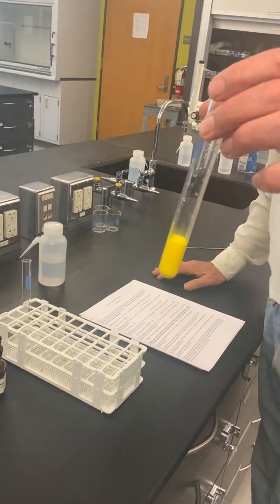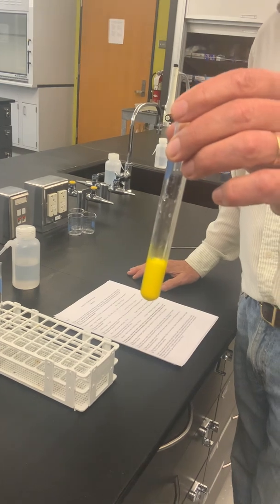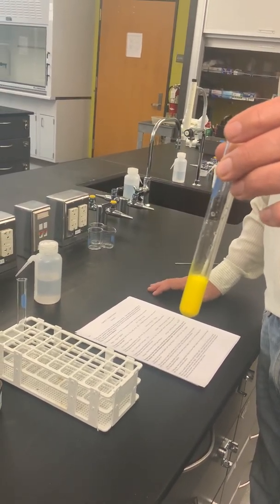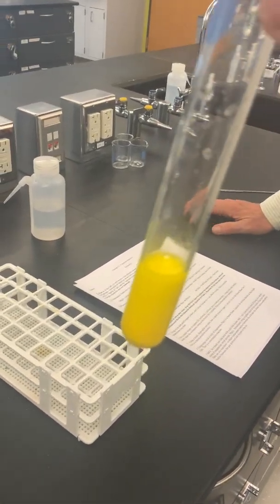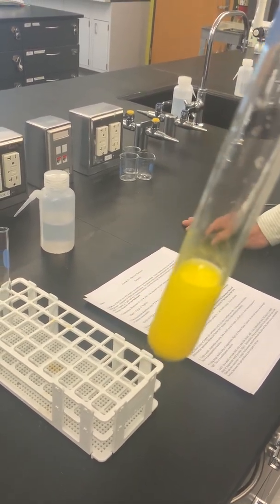2 things you might note here. One, of course, that dramatic, unexpected color change. And the second thing that might not be as easy to see in the video is that this new substance is no longer transparent. That is to say, it is opaque to the passage of light.